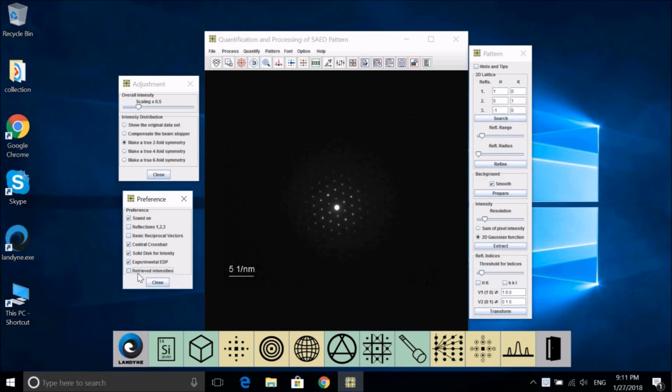The third application is line profile for both periodic or non-periodic lattices. This is for quickly measuring reciprocal spacing, which can be used in another software called Resize 3 for unit cell determination. To measure the linear profile, we select quantify one-dimensional profile.